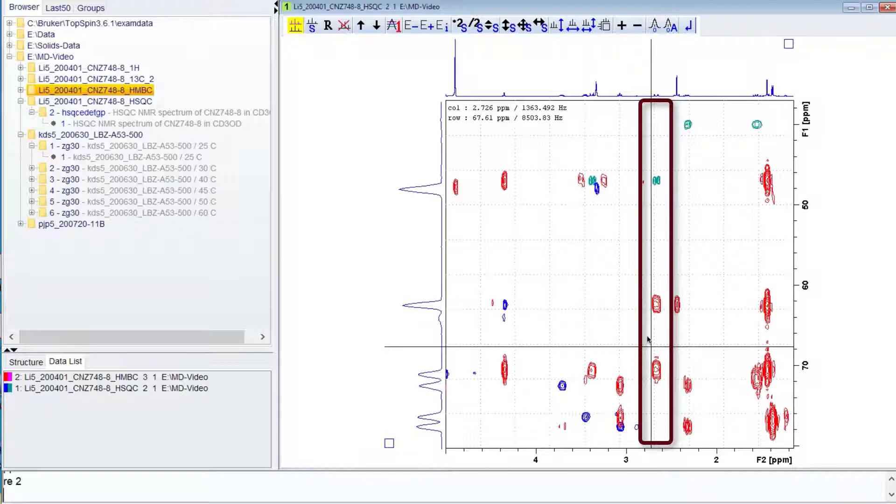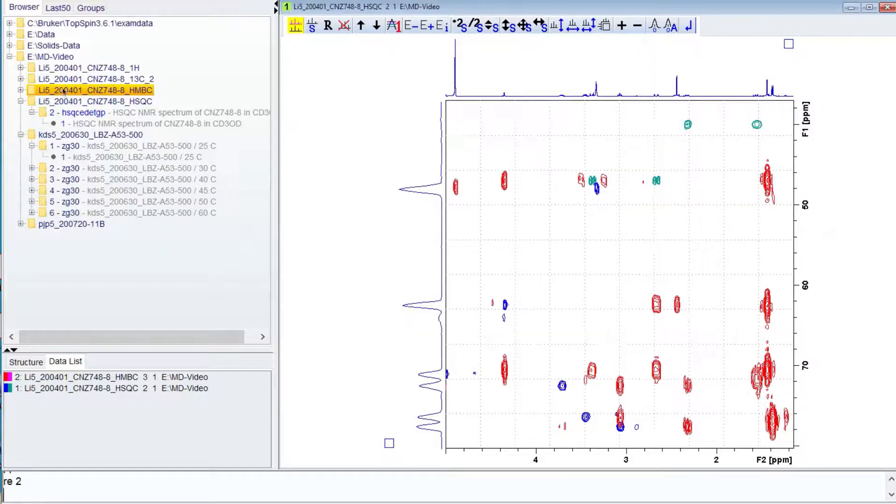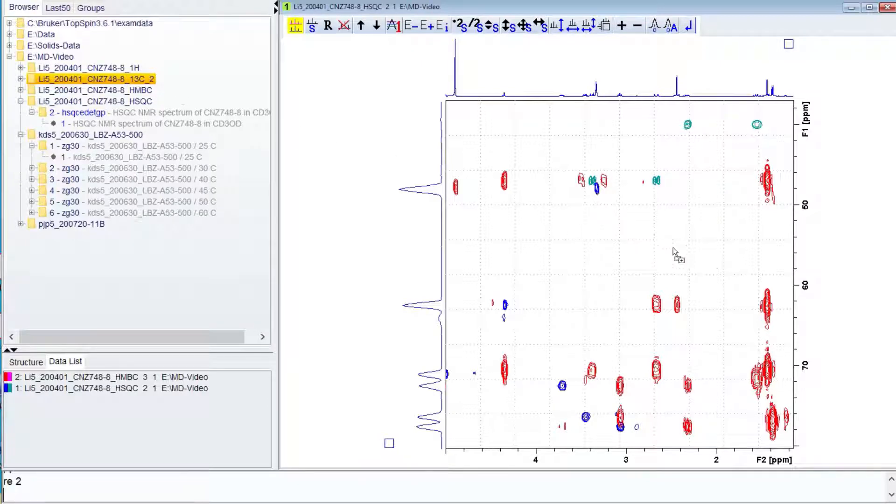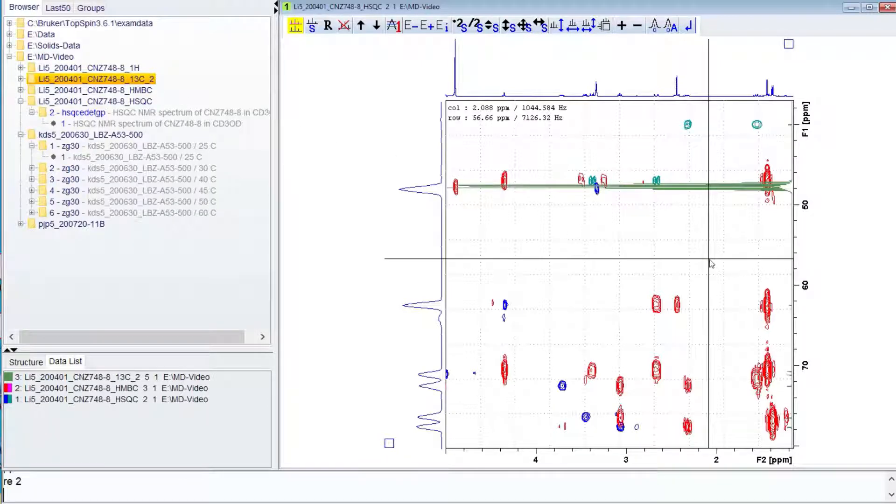The 1D carbon spectrum can also be added. This is helpful for determining assignments in congested areas.